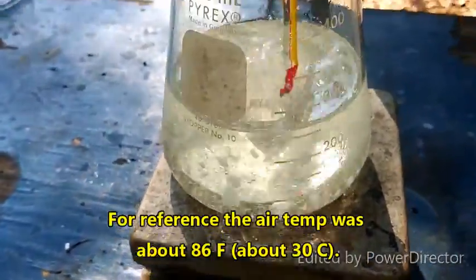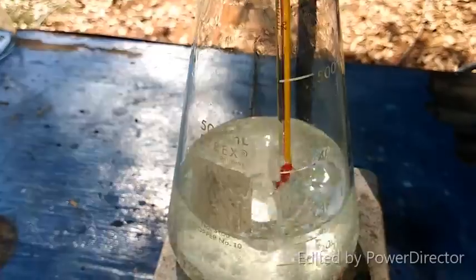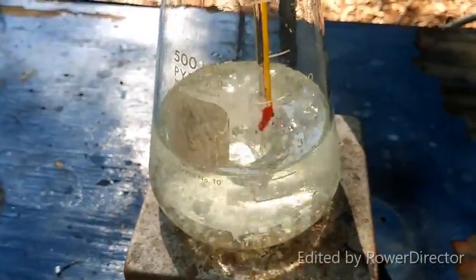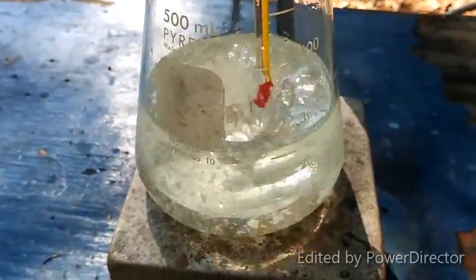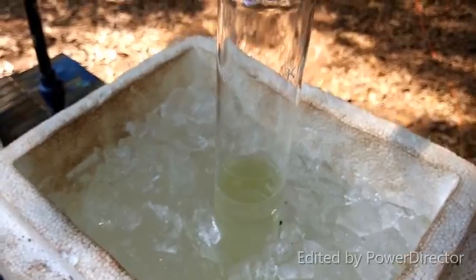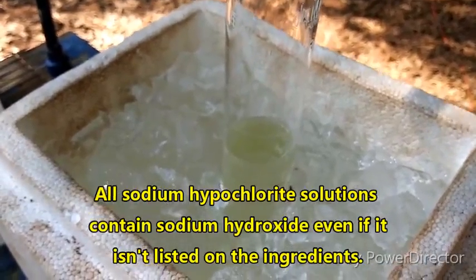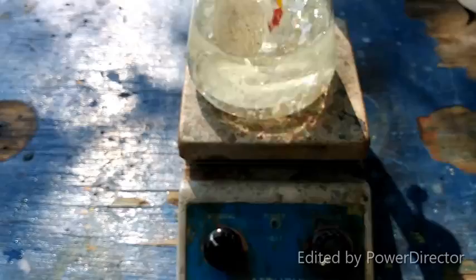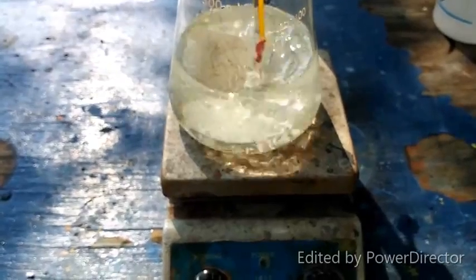And I have added a little bit of extra water, because I had to rinse some stuff that splashed up on the sides back down into the flask. I didn't really keep the water to a bare minimum when I did that. Yes, we want this to be alkaline, but the sodium hypochlorite solution also contains sodium hydroxide. It's also alkaline. Since I have not compensated for that in any way, that should more than make up for any dilution from rinsing stuff back down into the flask. I hope.